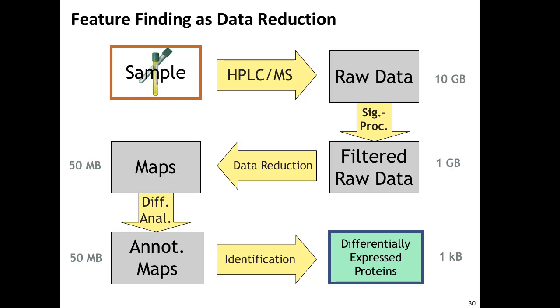Are you talking about the wet lab preparation or the data processing? Can you just realign any samples, can you align arbitrary samples? Yeah, we'll talk about normalization later on. The LC gradient has to be the same.